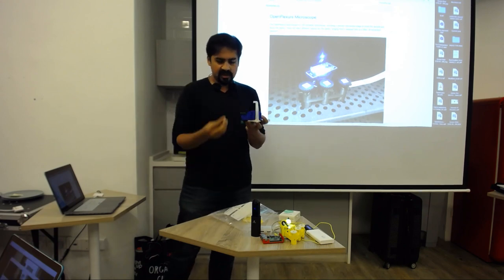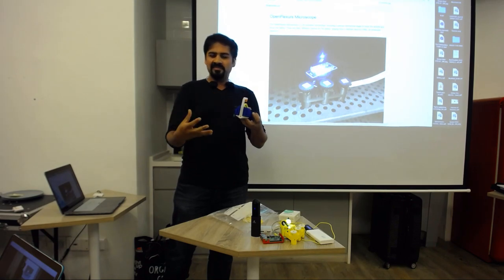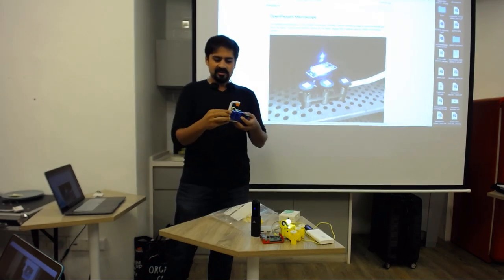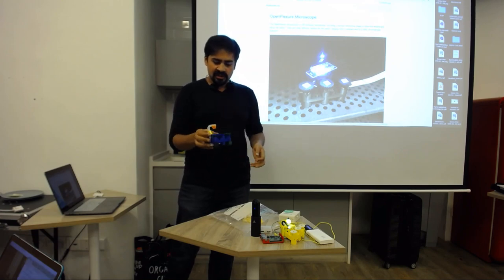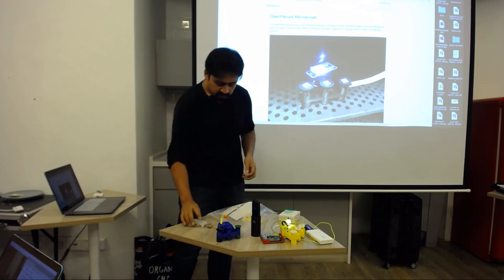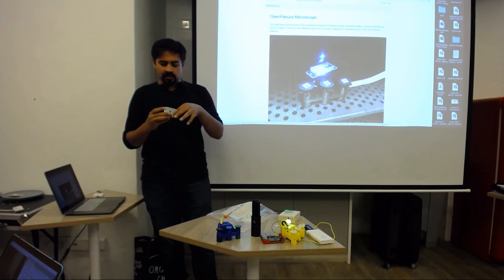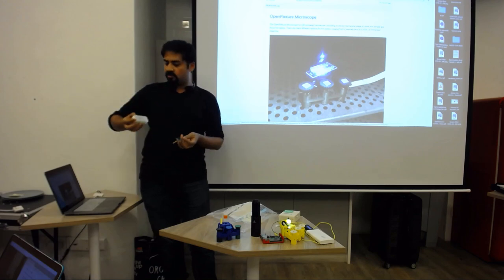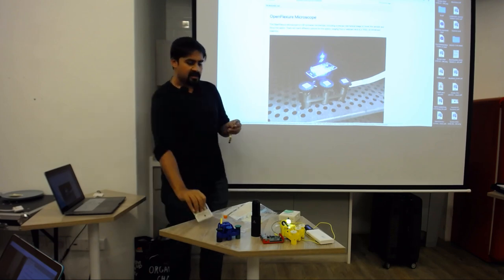And to make it work, you can add sort of a condenser lens on top. So it's bits and pieces that you can play with, right? You can print this on a different printer if you have to, or a different filament, make it look cool. So later on, try it. Also, I've tried to do this with a Raspberry Pi Zero, which is smaller and cooler and cuter, I think. And it works.